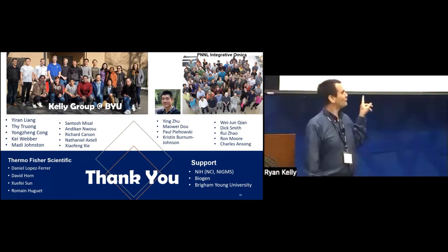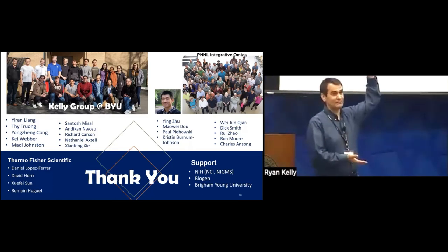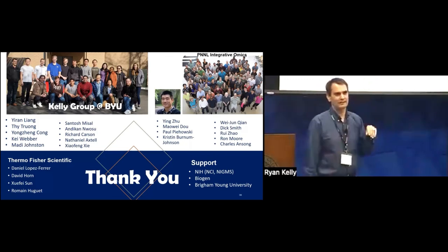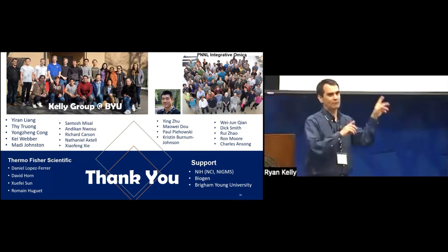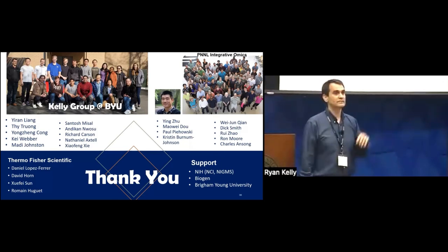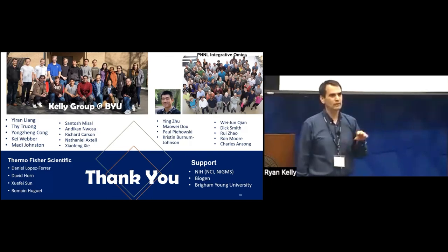I wonder if it's because you saw how many PSMs we have, but they're redundant. I wonder if that's oversampling and giving additional, multiple measurements of the same thing. I don't know. We need to compare that more with the standard DDA, for example. So we're in process, right?